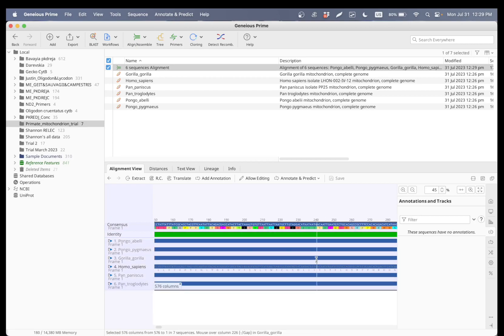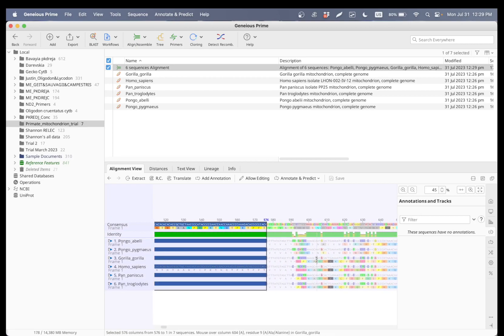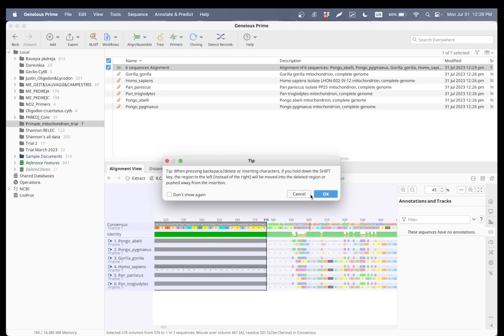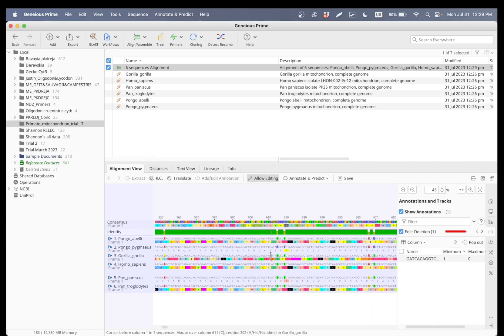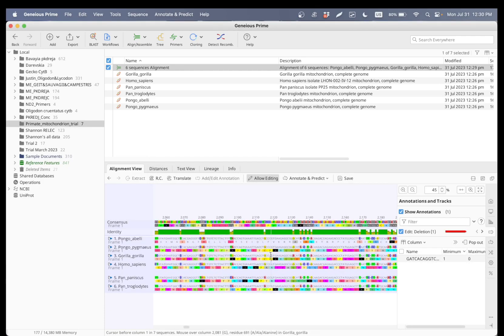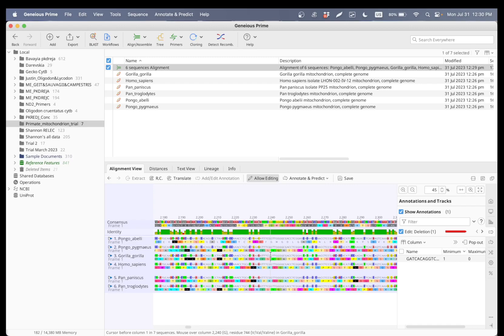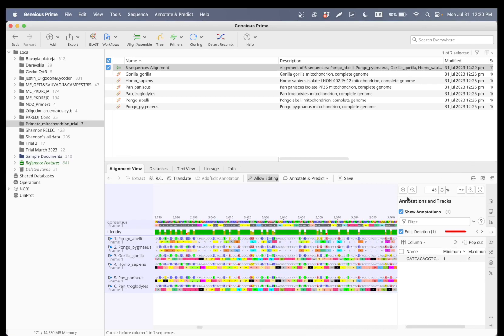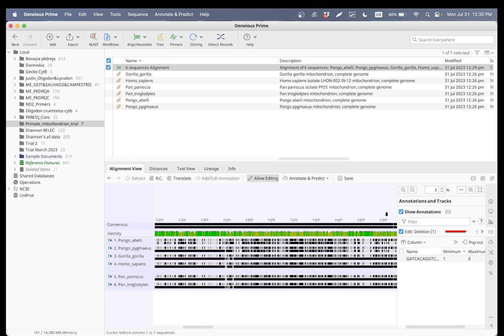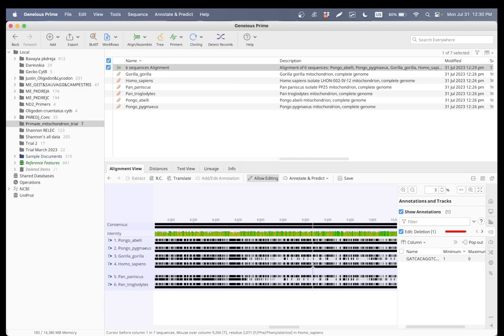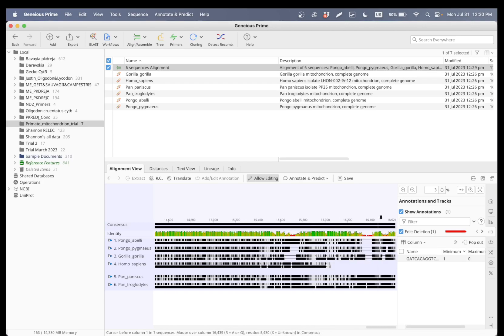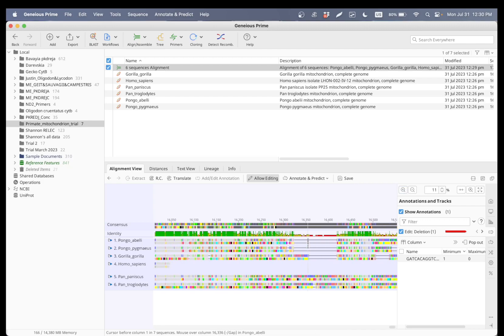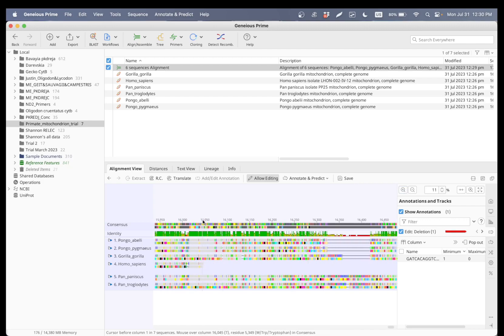I can just select this part which is only present in human, and go ahead and delete it. I'm going to say 'allow editing,' then press delete on my keyboard. That lets you delete all of these. I'm going to repeat the same process at the end of the sequences as well.